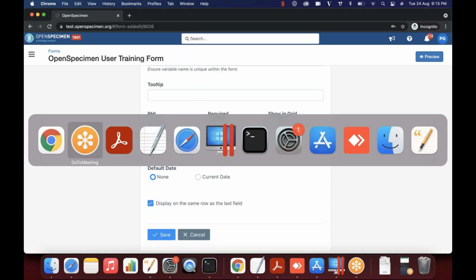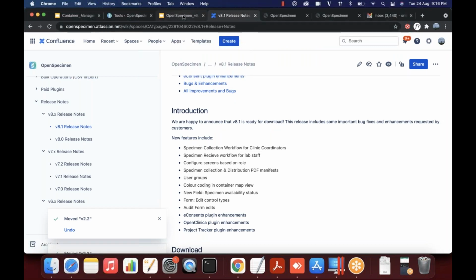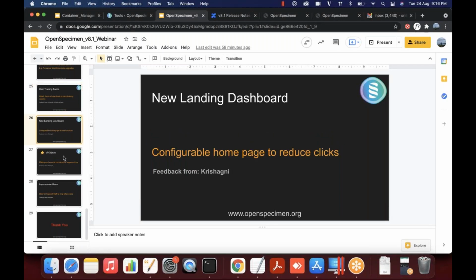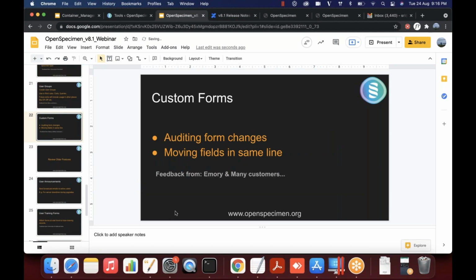So let me make one correction to this slide, here, and say 8.1. Okay, yeah. Thanks. Yeah, because I didn't need that.